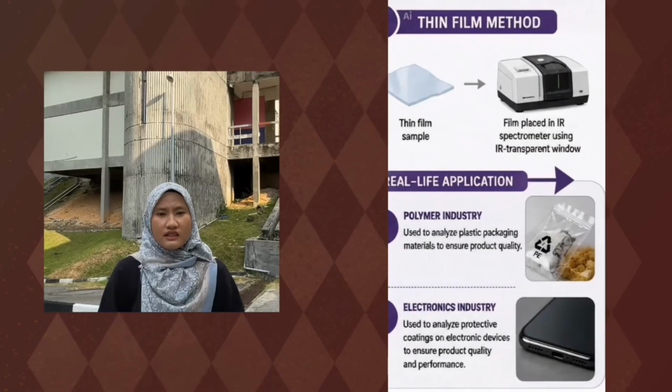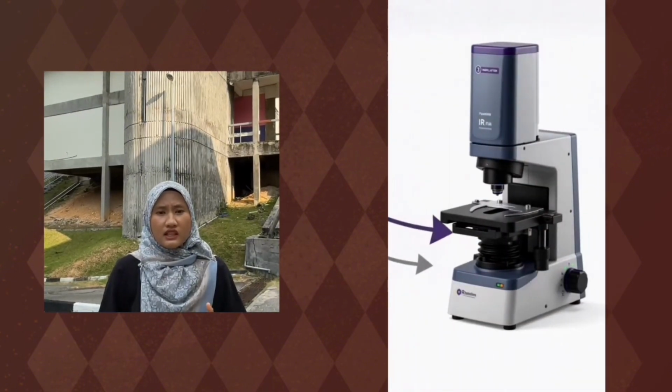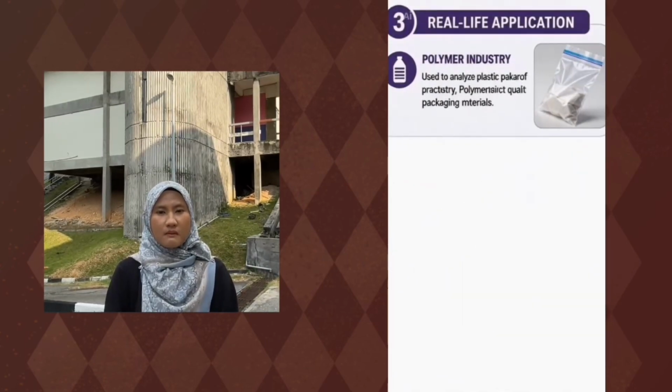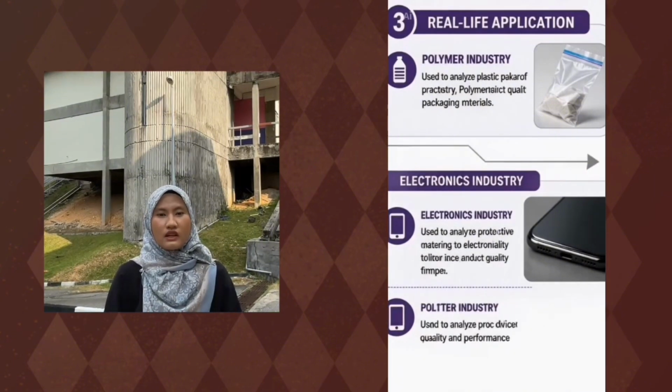And the last one is the thin film method. The thin film method is important in the polymer and electronics industry. It is used to analyze plastic packaging materials and protective coating on electronic devices to ensure product quality and performance.